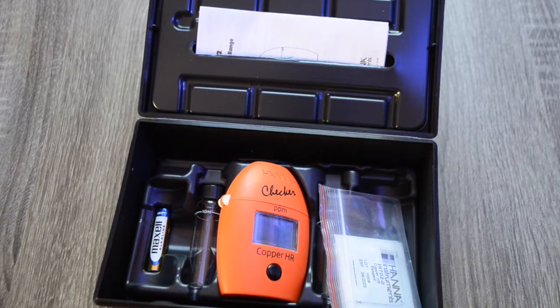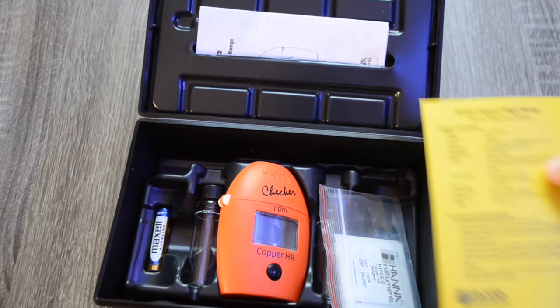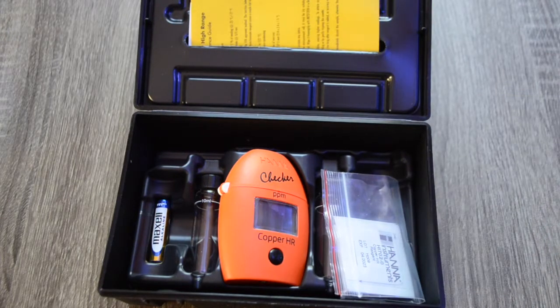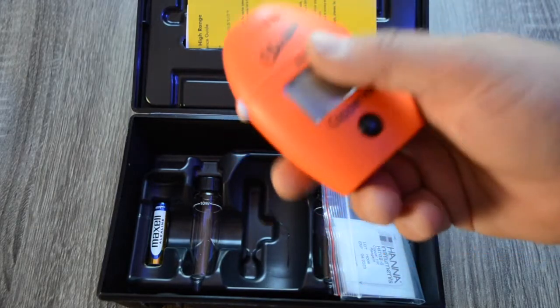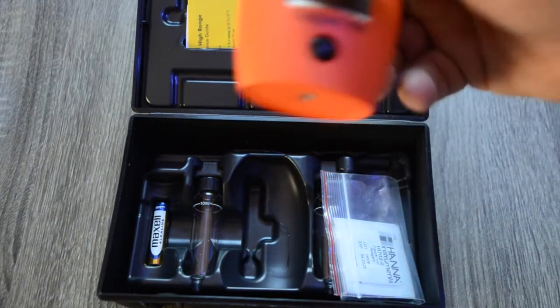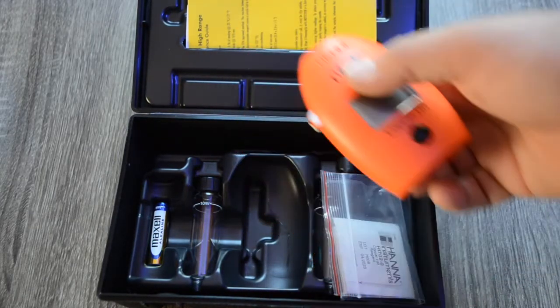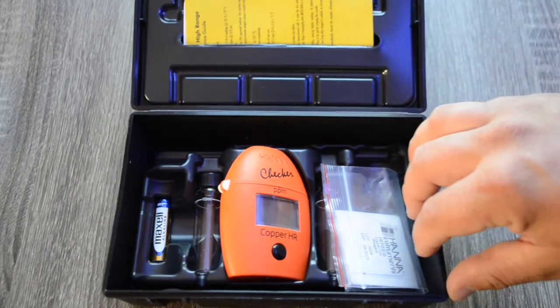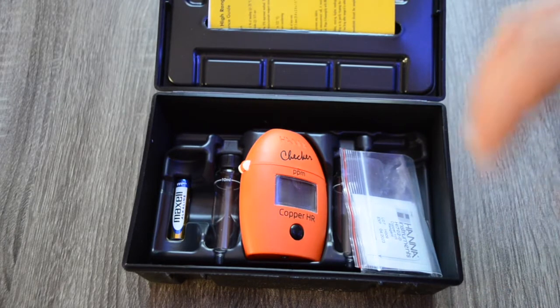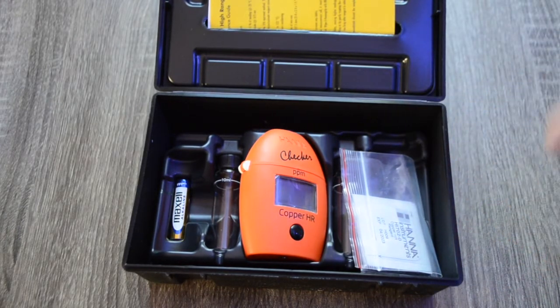The accuracy for this checker is plus or minus 0.05, which is pretty accurate especially for a hobbyist. There are so many things at play that can cause inaccurate readings with color charts and reagents. For a small investment, the Hanna checker line of products is incredibly useful and it's going to help increase your accuracy, making you a better reef keeper in the long run.